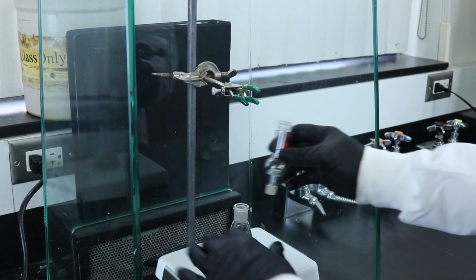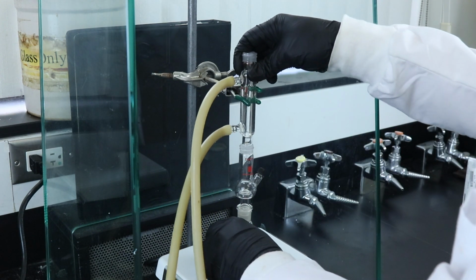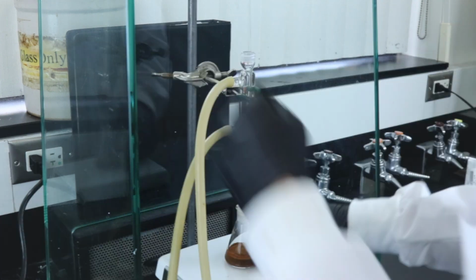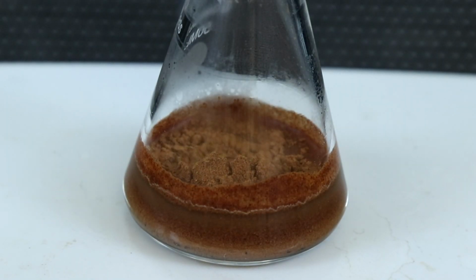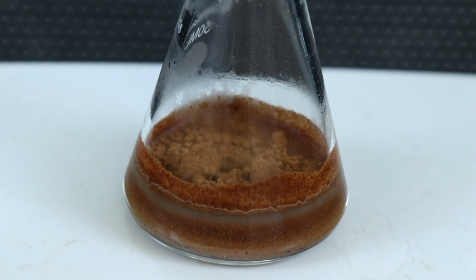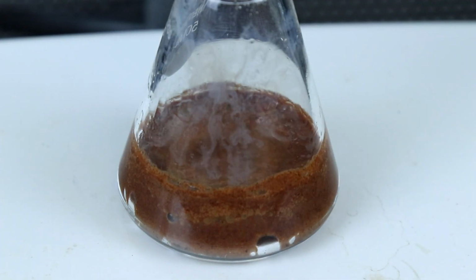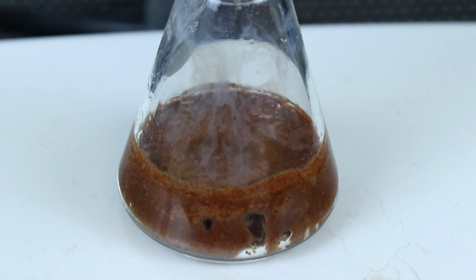Now I'll set up the apparatus, attaching the Hickman still and a water condenser on top of the Erlenmeyer flask, and then start heating things up. As it does warm up, you can actually start to see the milky distillate in the cinnamon, and as that begins to boil, we're going to see that a lot more on the sides of the flask.